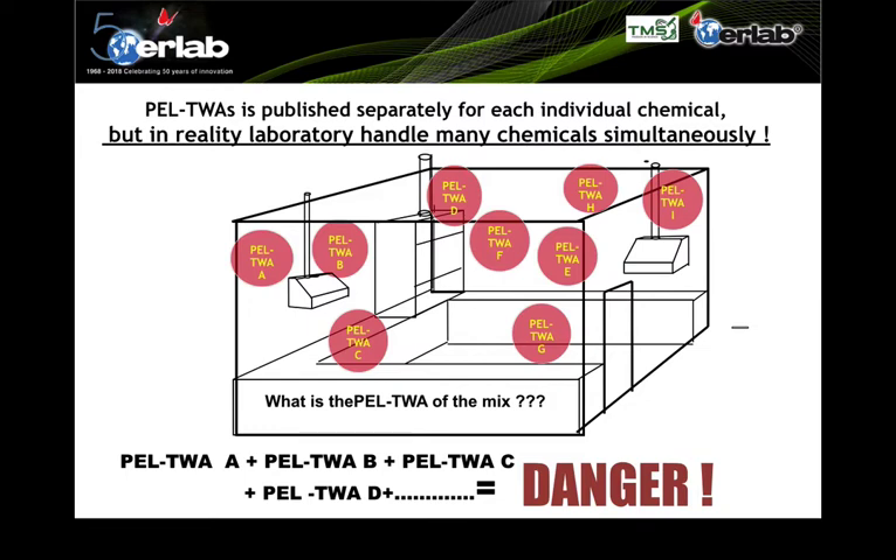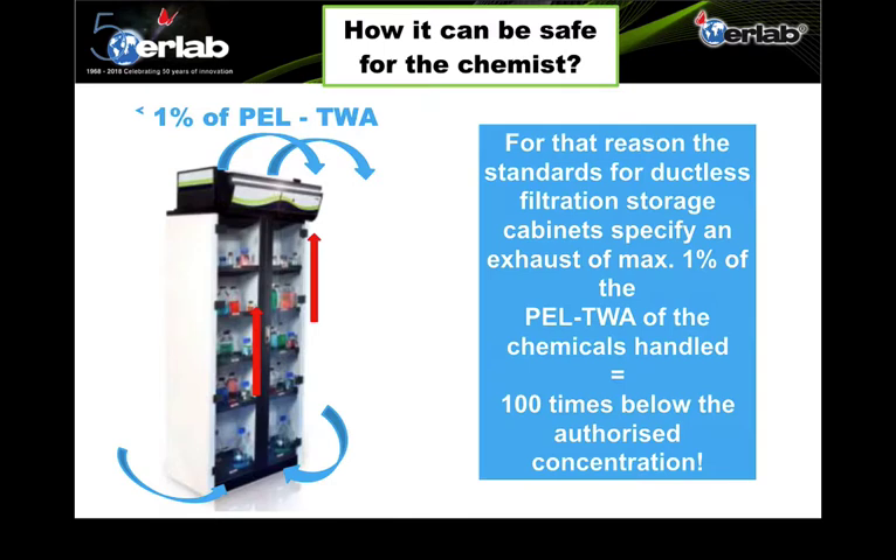PLTWA is published individually for each chemical and can be found in Safety Data Sheets (SDS), Section 8. In reality, most laboratories handle more than one type of chemical, and with a mixture the combined effect is unknown but certainly dangerous. International standards specify that a ductless filtration storage cabinet should exhaust no more than 1% of the PLTWA of any chemical stored — 100 times below the authorized concentration — ensuring user safety and laboratory air quality.